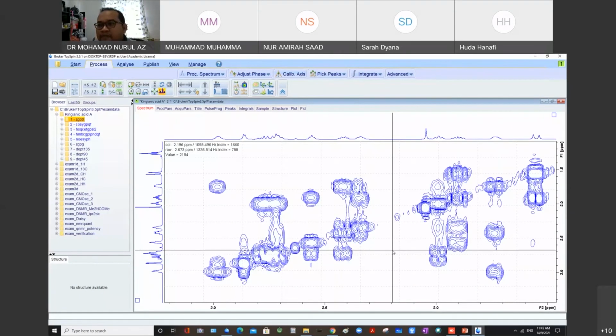This is very important. How to know it? You have to try. Like Tahir, you have your own NMR.